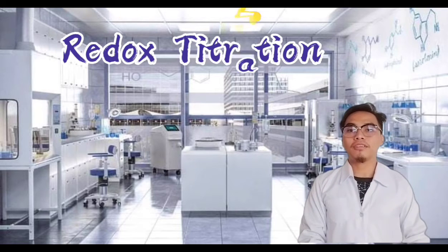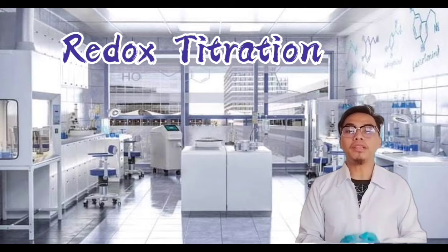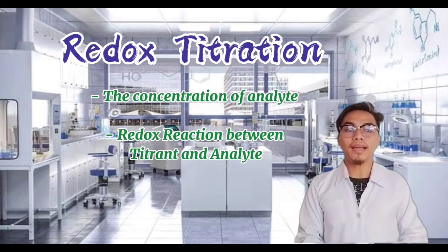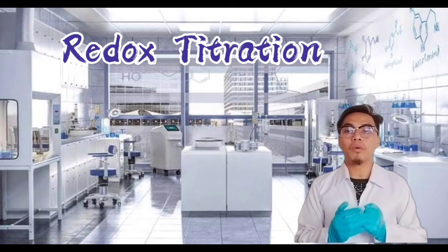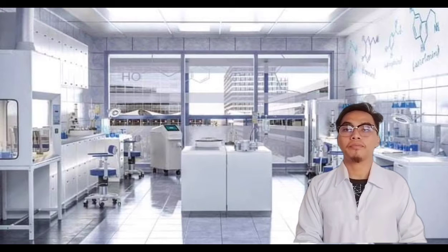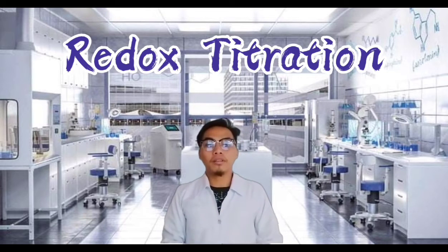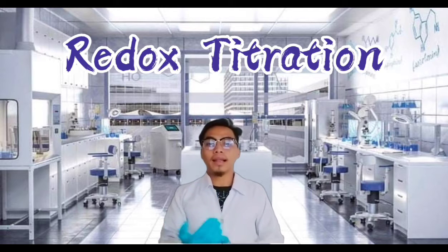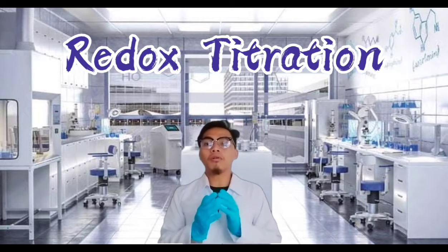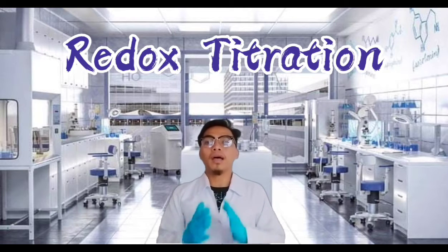Now, what is redox titration? Redox titration is a laboratory method of determining the concentration of a given analyte by causing a redox reaction between the titrant and analyte. This type of titration sometimes requires the use of a potentiometer or a redox indicator. Redox titration is based on an oxidation-reduction reaction between the titrant and analyte. It is one of the most common laboratory methods used to identify the concentration of an unknown analyte.